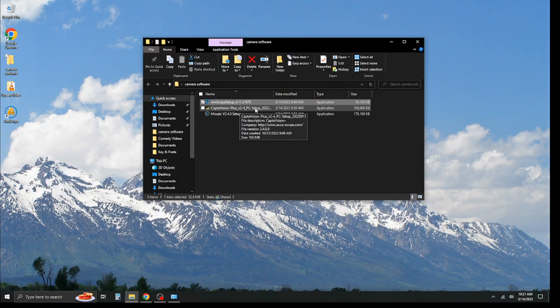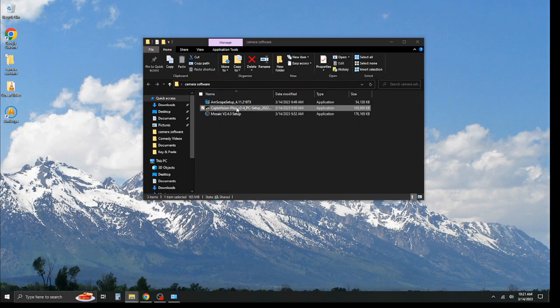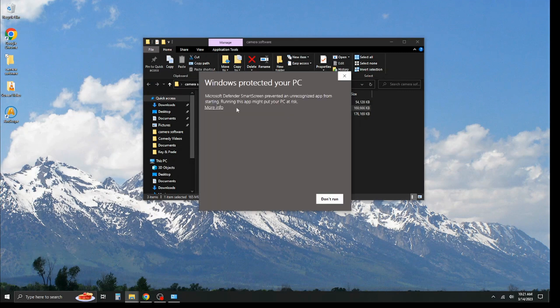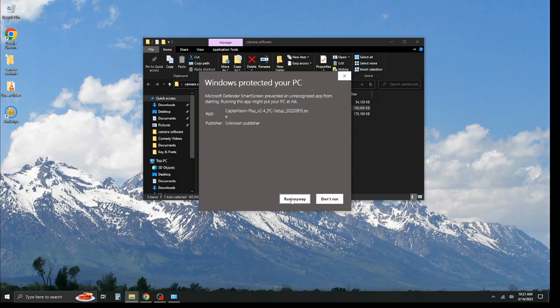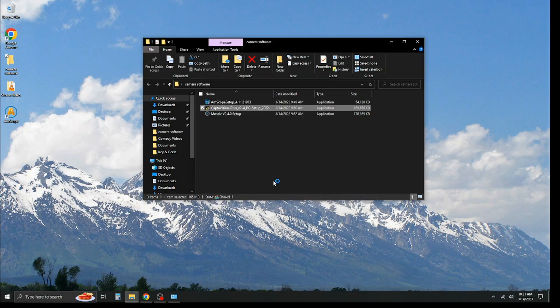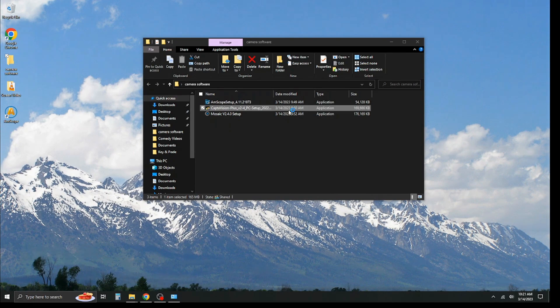Now, continuing down the order, we're going to download the CapDivision Plus. This is going to be the software you use for the Excelis cameras. One thing we've noticed from the CapDivision software is it tends to run into that Microsoft doesn't identify the software. So, all you do is click that little tab right there and hit run anyway. We've vetted this software before, and it's safe to use.